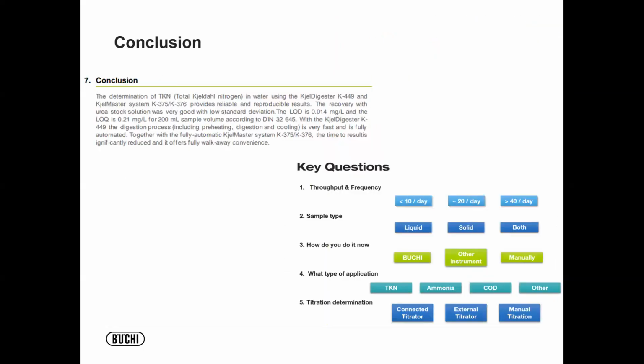So in conclusion, we were able to provide really great, reliable, and reproducible results using an automated Kjeldahl setup. The limit of detection was 0.014 mg per liter, and the LOQ is 0.21 milligrams per liter for about a 200 mL sample, which is what we used on the actual body of water examples, not the stock solution. And again, this is something that's completely compliant with standard methods 4500.